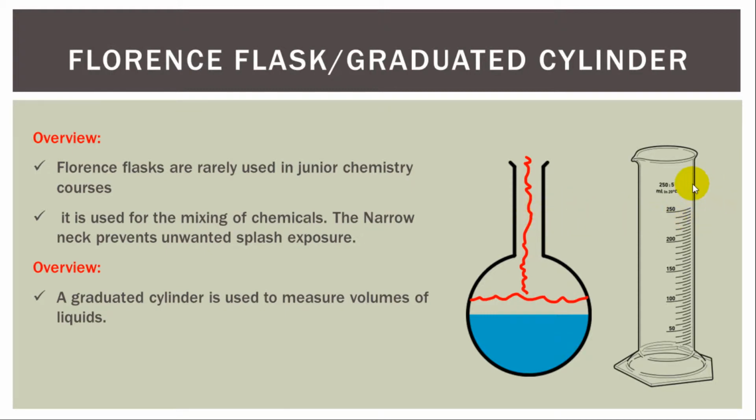Over here we have a graduated cylinder, and it's basically used to measure volumes. Let's say you had H2O or water in here, for example. You had it up to here. You could read on here and just measure it out. That's the purpose of that, just to get exact measurements of water or whatever liquid you're using. And this isn't for solids, only liquids.